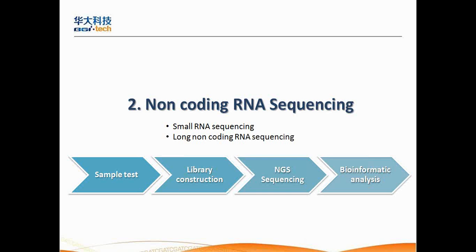And both the resequencing transcriptome and the novel transcriptome can help us to figure out the expression value of specific genes and which genes are upregulated or downregulated in different samples, maybe in different tissues or maybe in different stages.